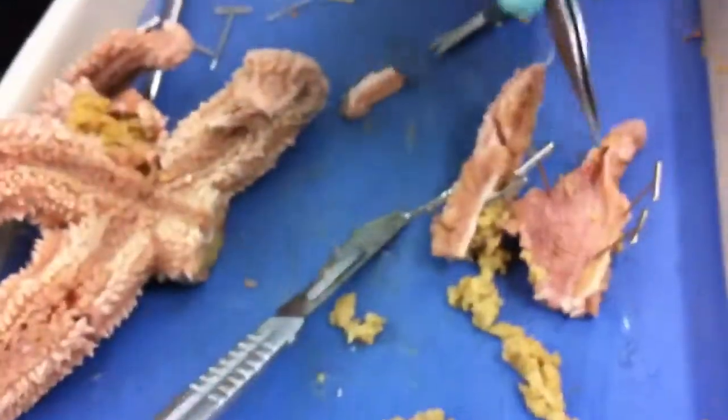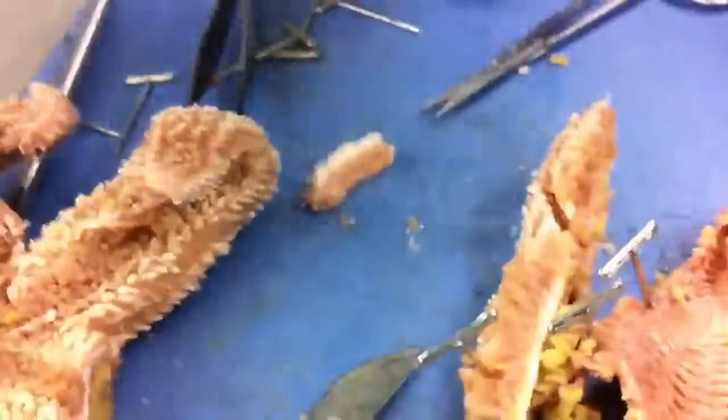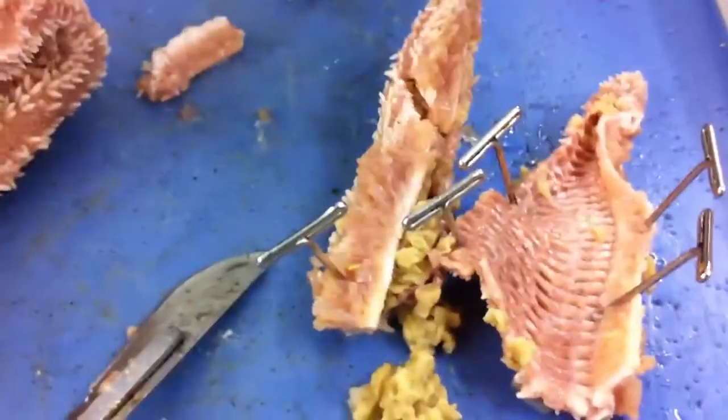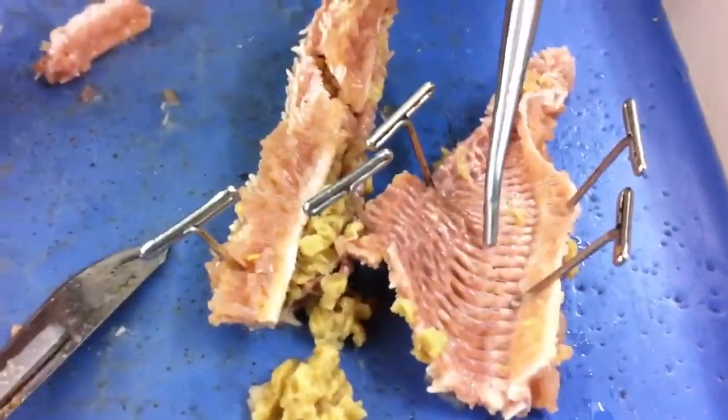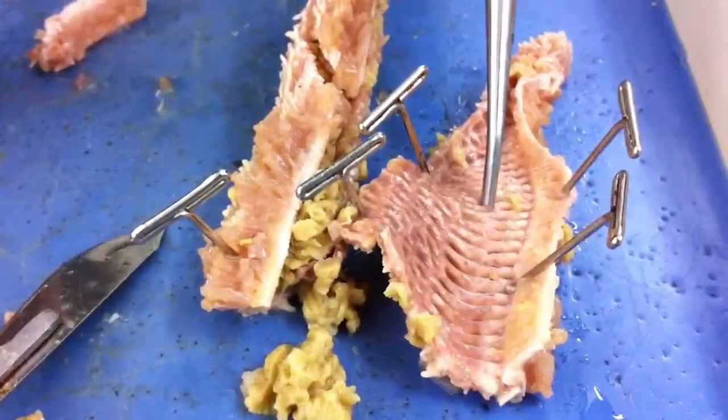This is what happens if you get caught. And then this is, I don't know, a bunch of little tissue — horse tissue or something? Yeah, like, looks like it could be veins or... I'm not really sure.